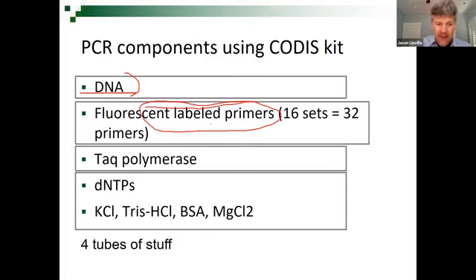All right. They also give you a PCR mix, everything you need to do PCR, except, similar to before, in these kits they tend to keep the Taq polymerase separate. And the reason is sometimes when you're dealing with degraded DNA in a forensic science lab, or inhibition, which we'll talk about later, you want to give it a little bit extra Taq. So the reason the commercial companies don't put the Taq in with their PCR mix is they want to give the forensic scientists freedom to increase that amount of Taq if needed.